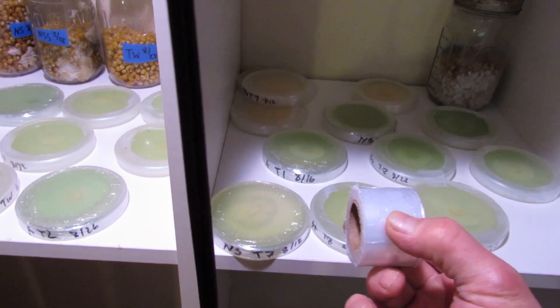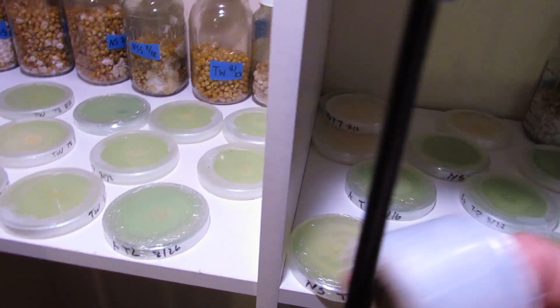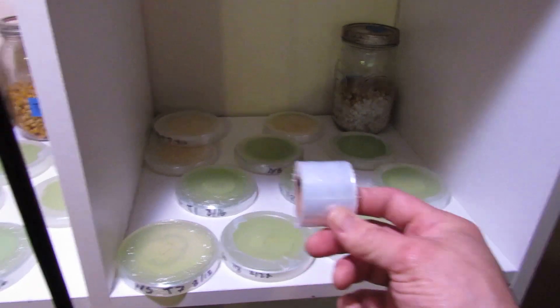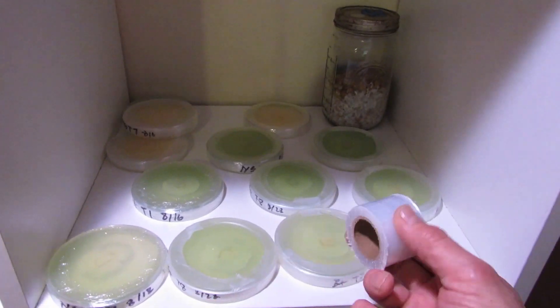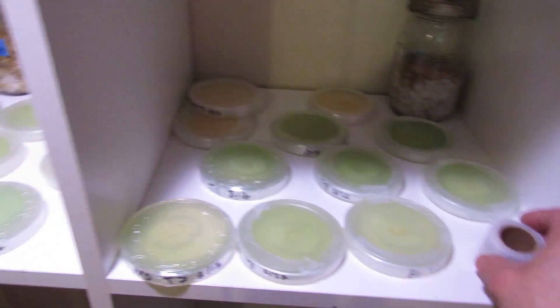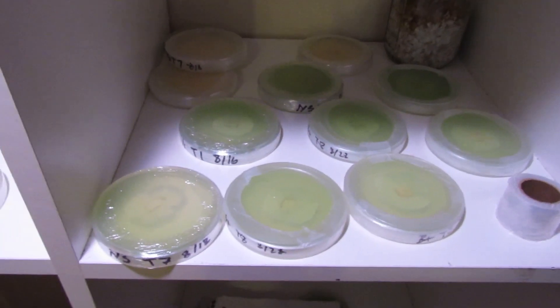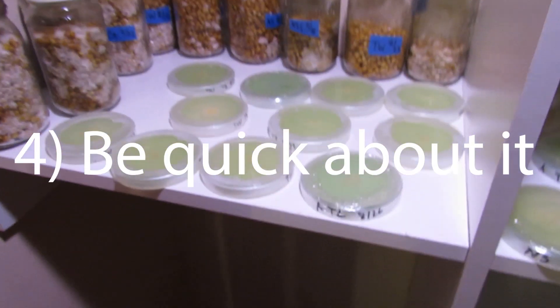It is a lot cheaper, but I did have more plates get contaminated using the cling wrap than using parafilm. If you do use it, make sure you apply some heat — grab some barbecue tongs and hold it in front of a space heater or over the stovetop. You want to apply just enough heat to make it shrink-wrap and suck tight around your plates.